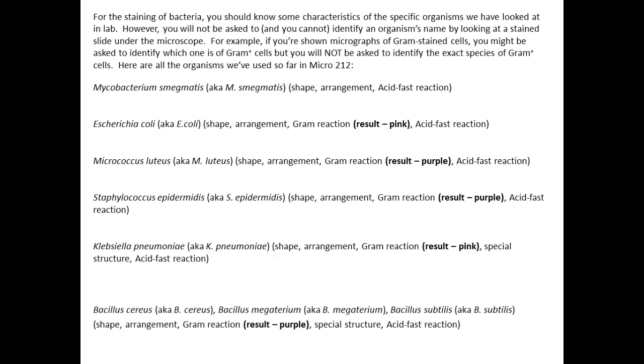Staphylococcus epidermidis. Shape. Cocci has it in its name, right? Arrangement's in its name too. It's going to be clustering. Gram reaction, it would come out purple, so it's gram positive. Acid-fast, what would it come out? Non-acid-fast or negative.